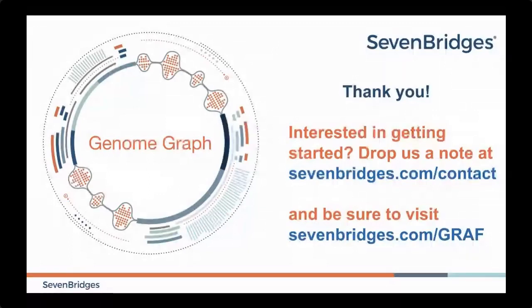our vision for graph references is that we want to go beyond alignment simply. So we want to incorporate more information in the references, which will help identify variants more accurately. For example, allele frequencies and linkages in cohorts, phasing in trio graphs, and so on. Do you want to add anything to that, Sarath? Not really, but I think you explained it very well.